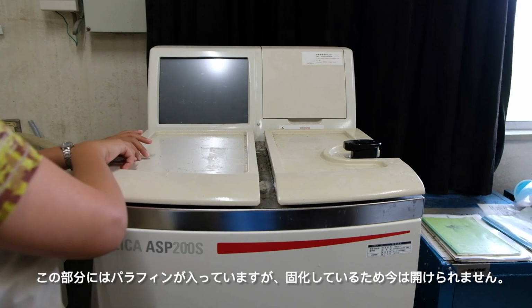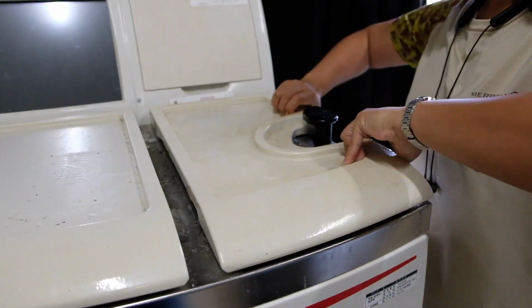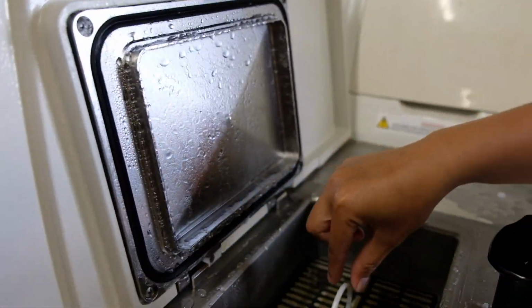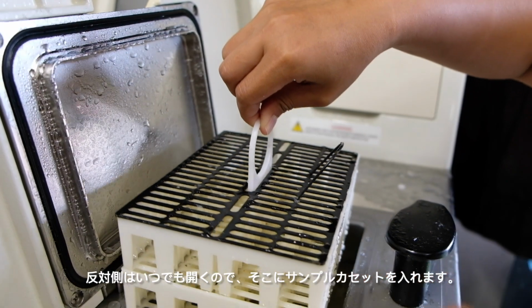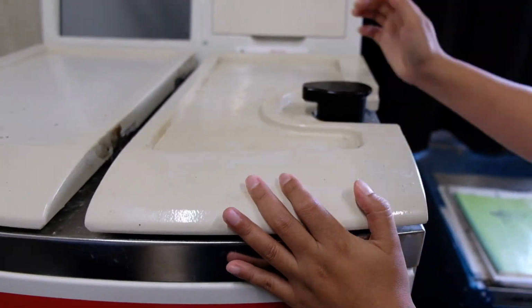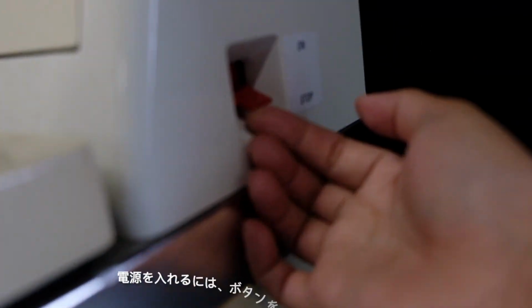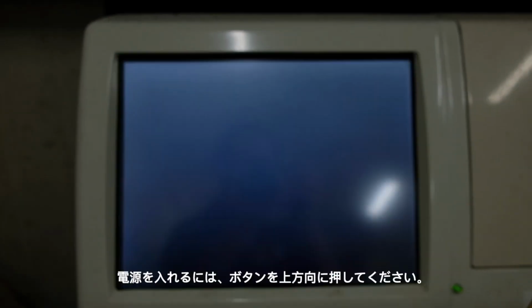This part of the machine contains the paraffin, but it won't open because it is solidified. The other side will open, and it is where we will put the cassette and samples. To turn on the machine, simply push this button up.